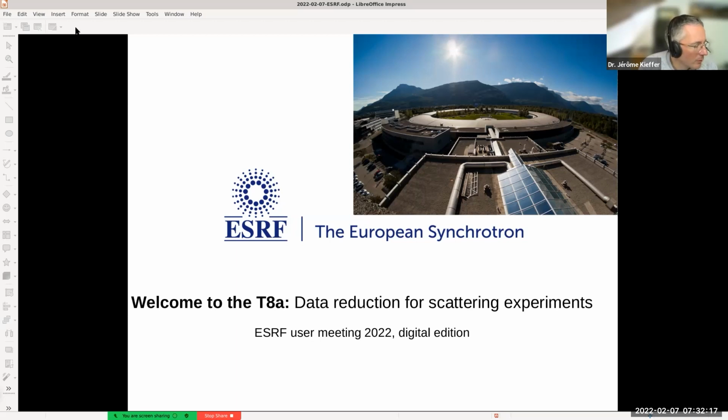Maybe the first one is the one that is already used, for example, in diffraction tomography or things like that, where you want to get rid of Bragg peaks in your data, and you're recording some smooth amorphous signal, sometimes a SAXS signal, and the Bragg peaks coming from larger crystallites in your system are creating some disturbance in your data analysis.